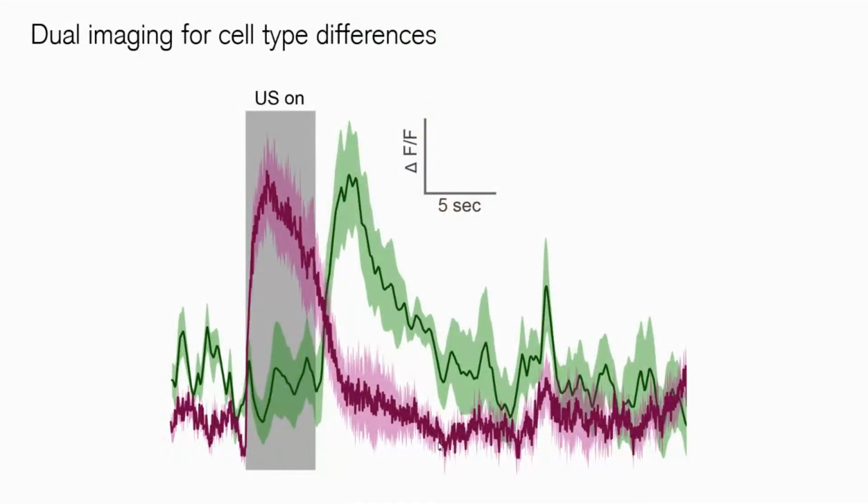The other reason I have been attracted to imaging is because you can do dual imaging of different cell types. Many people would argue that electrophysiologically, you can still differentiate cell types, but it becomes much harder when the cells are similar. Imagine I'm trying to distinguish D1 versus D2 receptor expressing neurons in a similar field. The size is similar, so you might not see that electrophysiologically. Here, I'm imaging dopaminergic versus GABAergic cells at the same time, flipping two different fluorophores on and off really quickly.